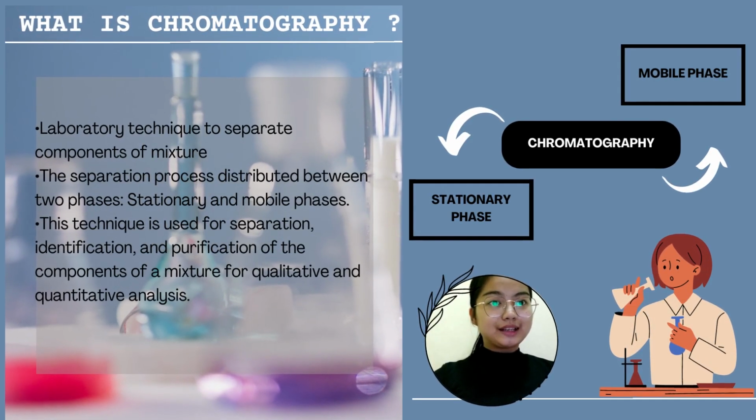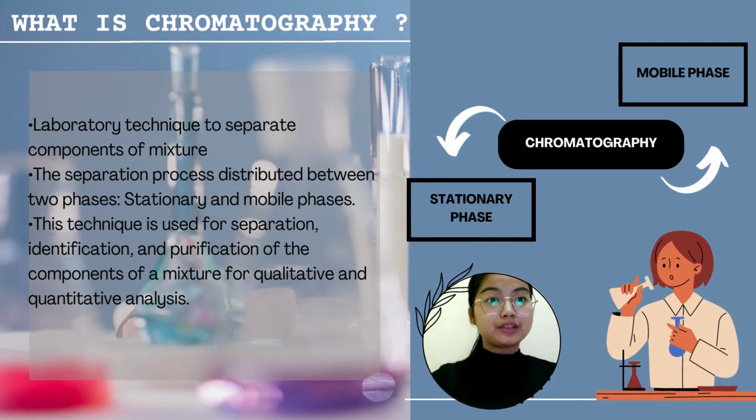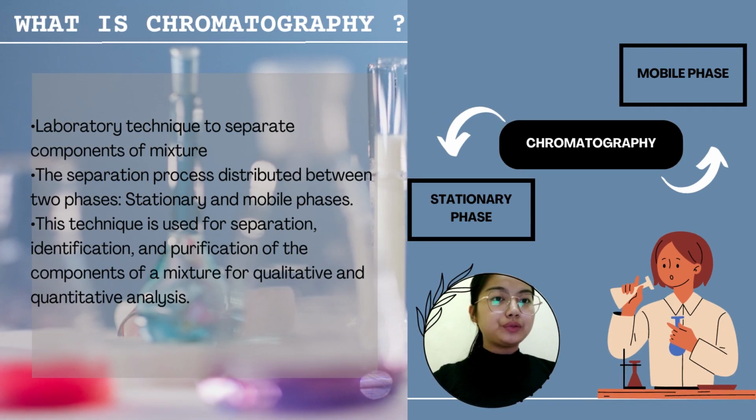Chromatography is a laboratory technique to separate components of a mixture. The separation process is distributed between two phases, which are the stationary and mobile phases. This technique is used for separation, identification, and purification of the components of a mixture for qualitative and quantitative analysis.